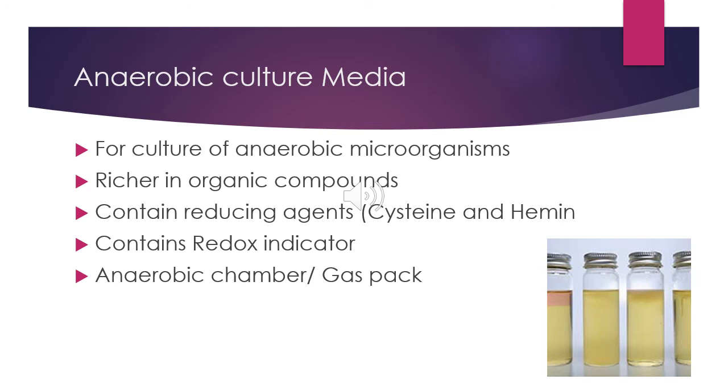They contain reducing agents such as cysteine and hemin. They have a redox indicator, and usually they are equipped with an anaerobic chamber and a gas pack to remove excess oxygen within the area of the media.